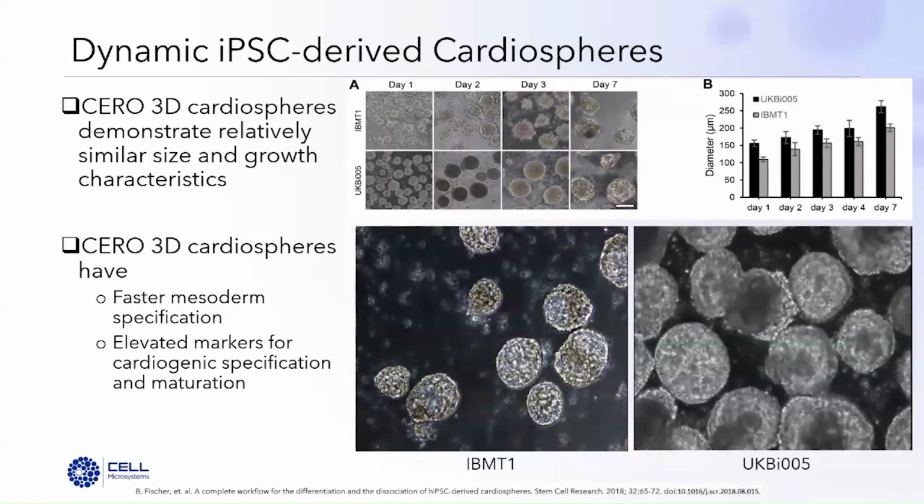And you can see here in these videos that for each of the cell lines that they were testing, they get this canonical beating morphology with their Zero 3D protocol.